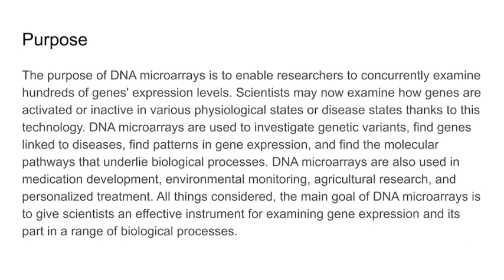DNA microarrays are also used in medication development, environmental monitoring, agricultural research, and personalized treatment. All things considered, the main goal of DNA microarrays is to give scientists an effective instrument for examining gene expression and its part in a range of biological processes.